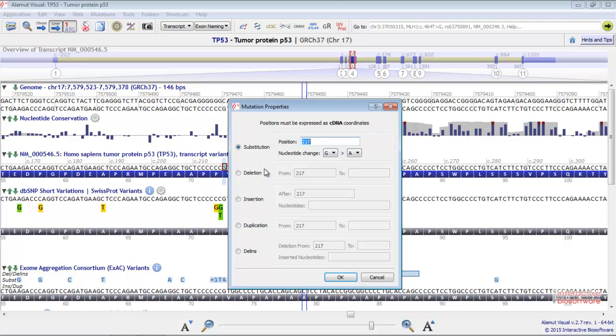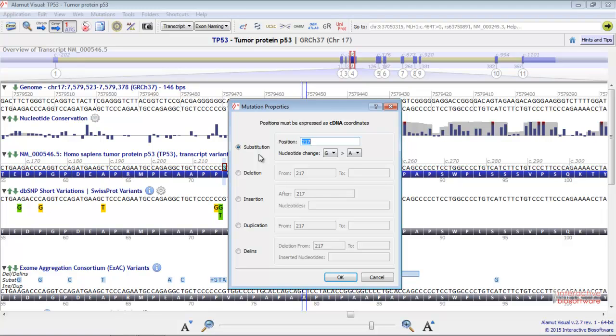You need then to choose the type of mutation you want to create: substitution, deletion, insertion, duplication, or delins. Let's make a substitution with a nucleotide change from G to A.